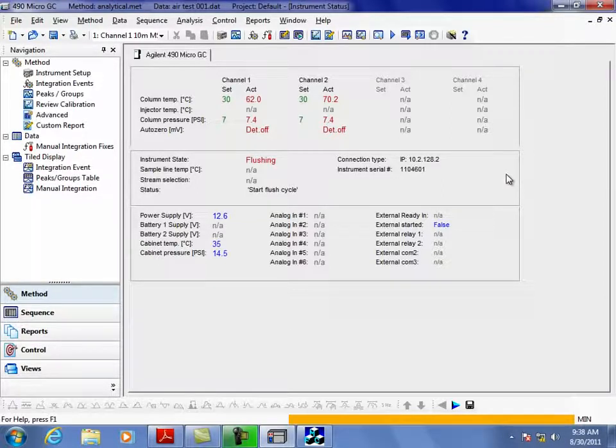I was with Varian, but not when the acquisition happened. I started with Varian in 1988 and worked for them in the inside sales group and in tech support, and then became the product specialist for the Micro GC when we bought ChromPack. So I know the previous version of this and the 4900.